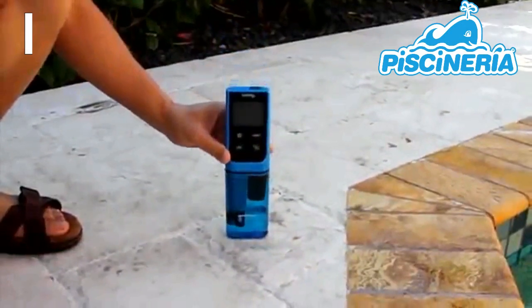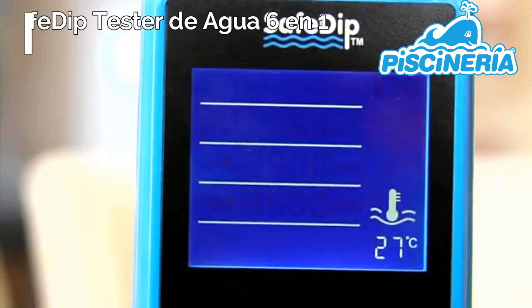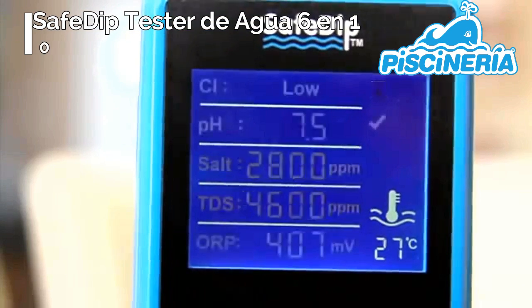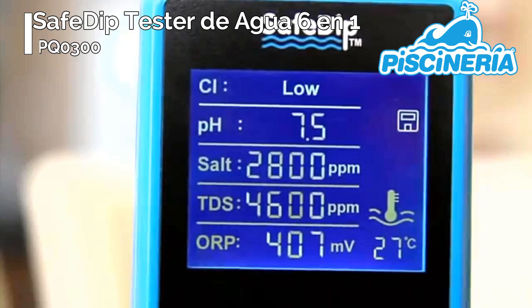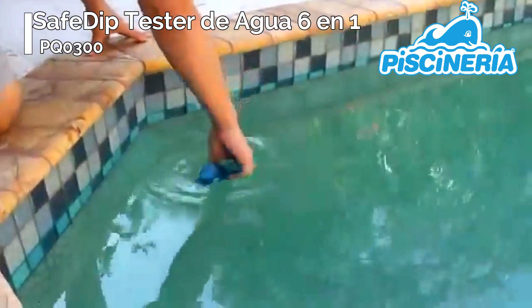SafeDip is a portable electronic testing station used by professionals and pool owners to accurately measure the most important parameters of water balance. SafeDip is commonly used to test swimming pool water.